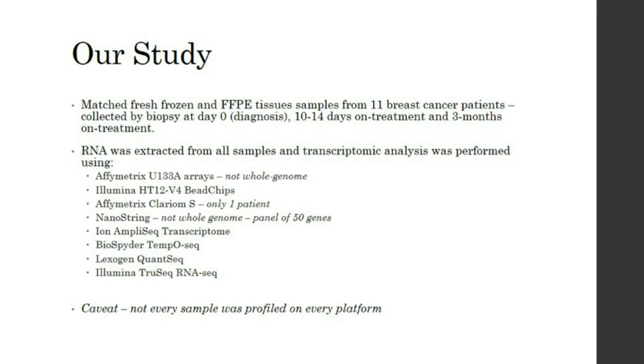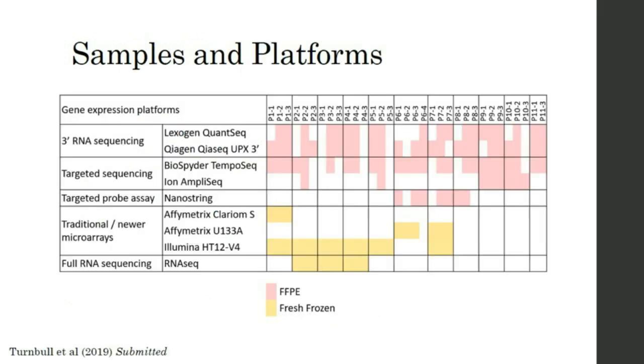The other caveat here is that this was not designed to be a technical comparison study. So we don't have every sample on every platform. We performed quite an extensive suite of trial experiments in these different technologies, and then later decided that there was enough of an overlap to perform this study and just have a think about integrating these kinds of data.